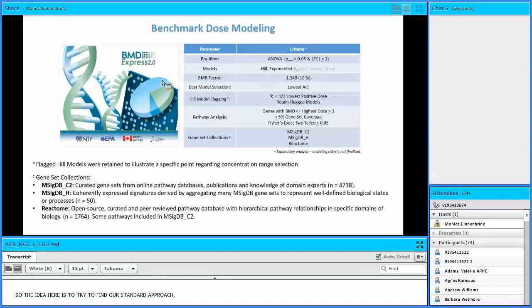But for right now, I'm just showing the different decisions I've put in place for this particular analysis as we're evaluating how these different choices affect our output. So from right now, we're applying a pre-filter on the chemical level, looking at the discrete chemical set within a median time condition.